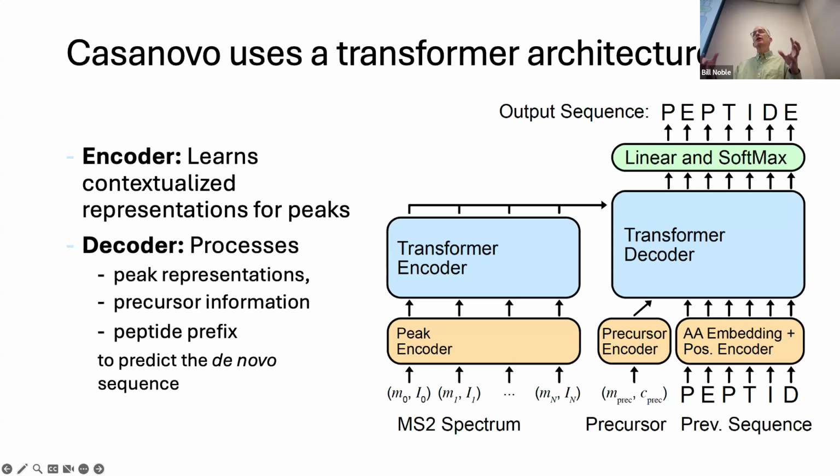And the idea is that by looking at many millions of these spectra, the attention mechanism can pick up on important dependencies. Like, for example, the prefix and the suffix add up to the same total mass, right? And those pairwise relationships should be picked up. Or every time you have a particular amino acid, there's a difference in m/z that's characteristic of the presence of that amino acid.